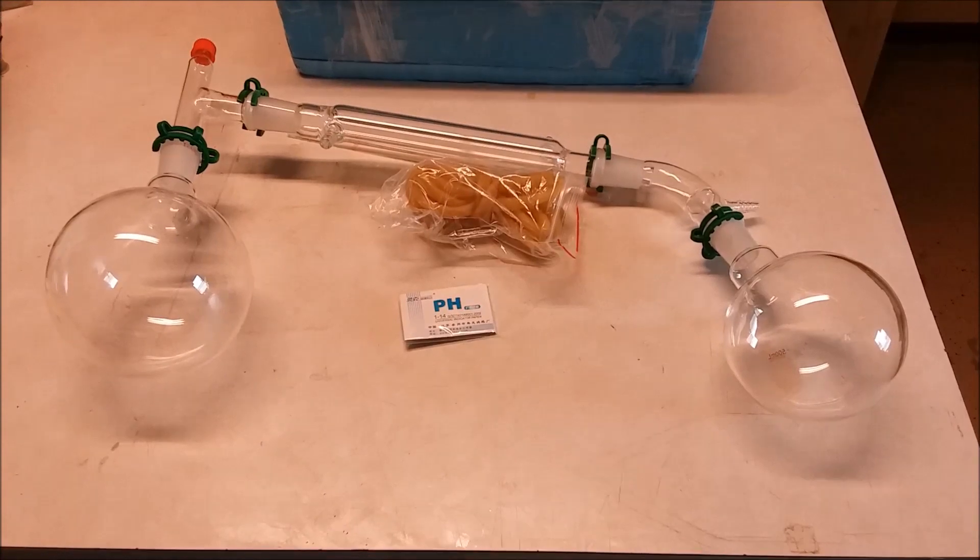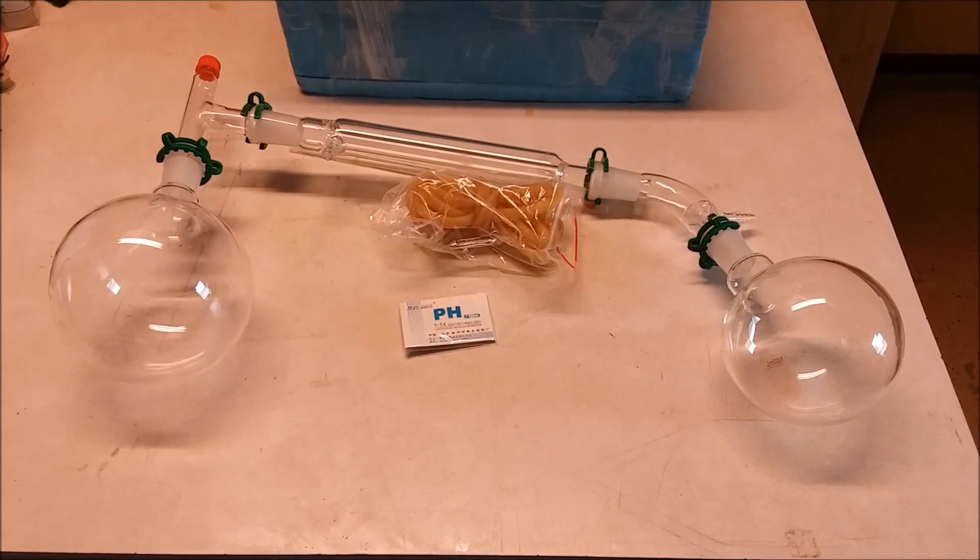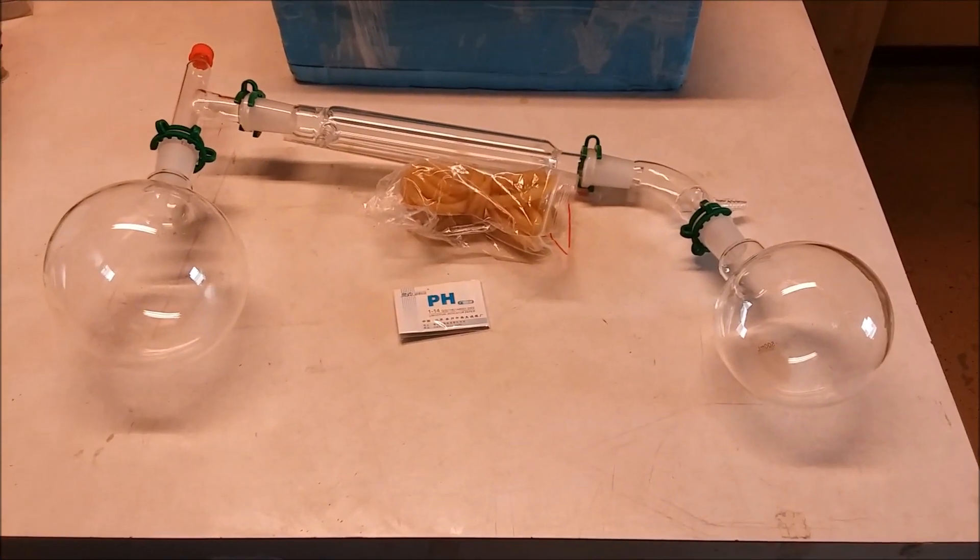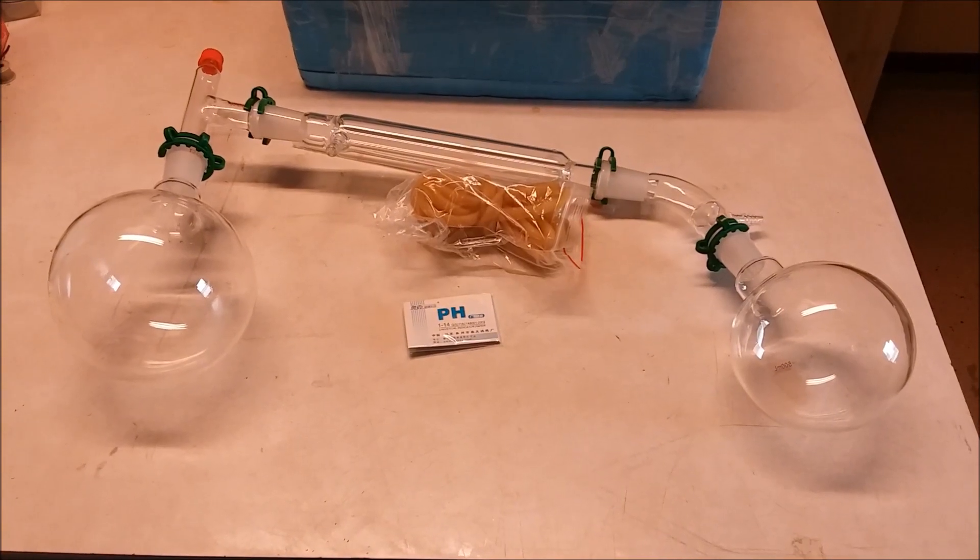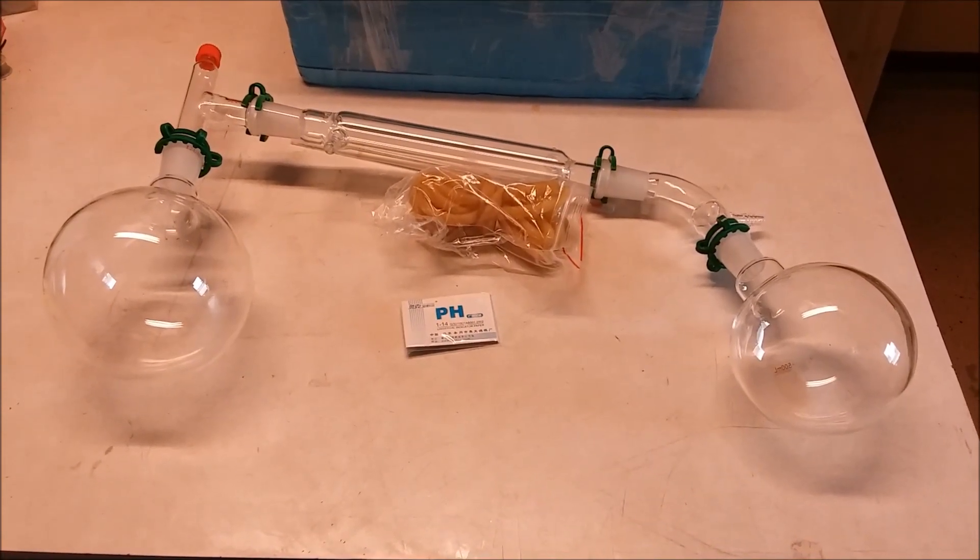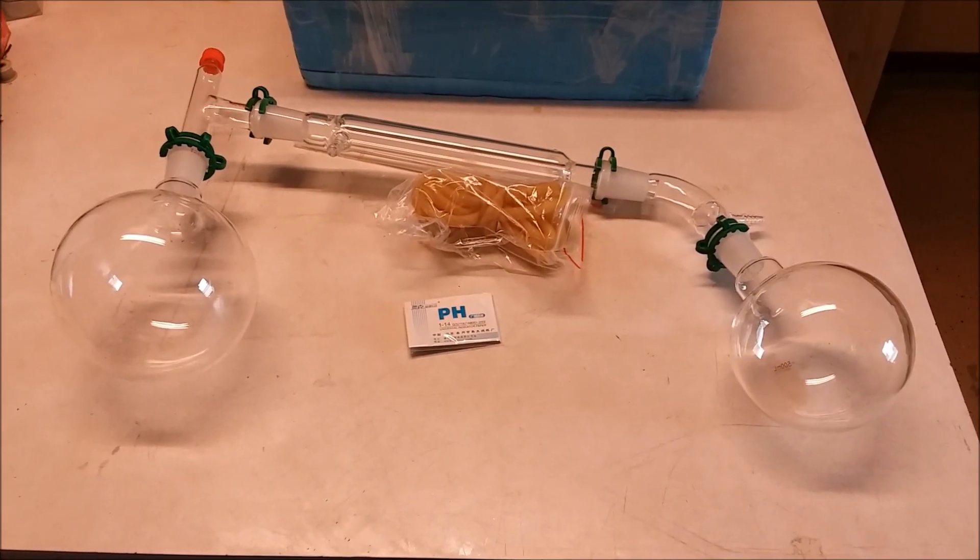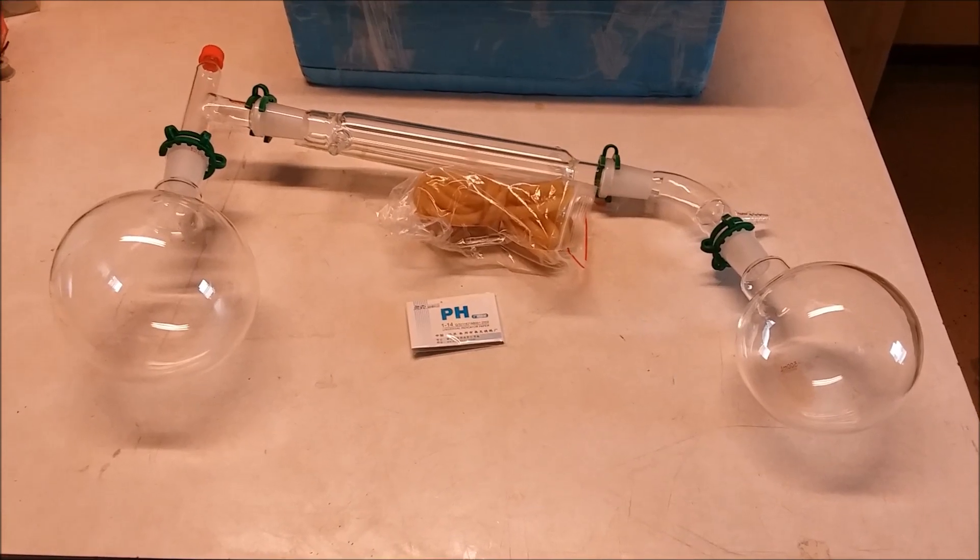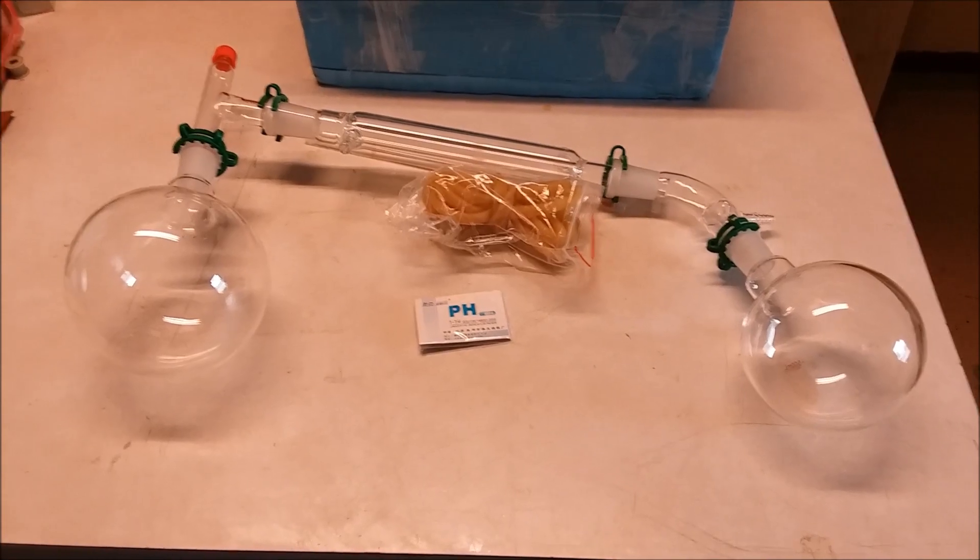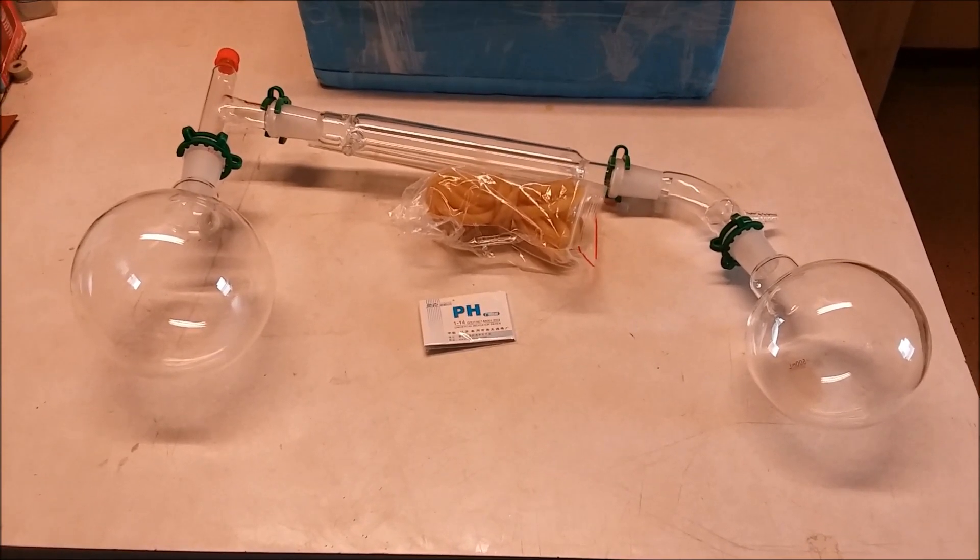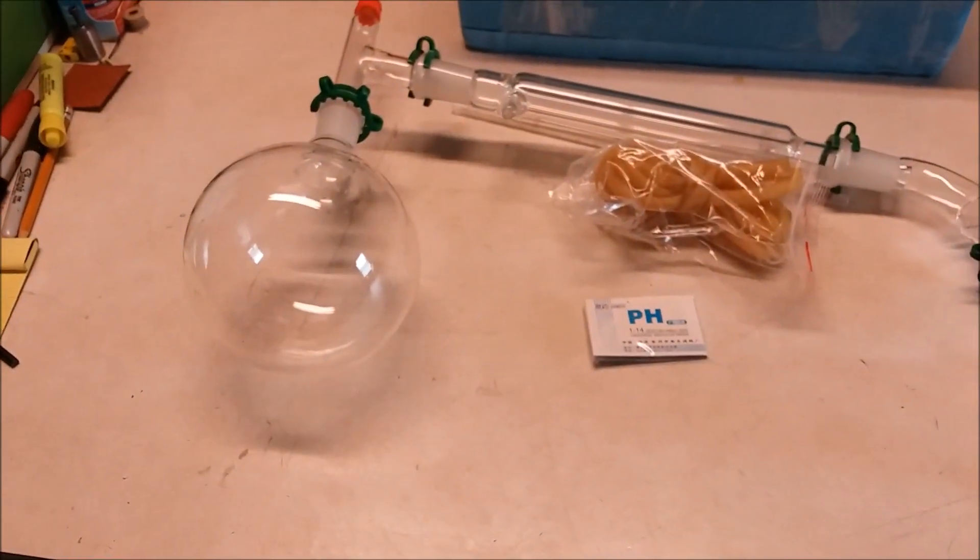I'm going to be able to make my own real nitric acid soon. I bought a few accessories for it too. I bought some more hose because it didn't come with much for the condenser, and I bought some fittings so I can hook the hose up to a garden hose to get a low flow through the condenser. I've got some stands and clamps and all kinds of other accessories for chemistry use.